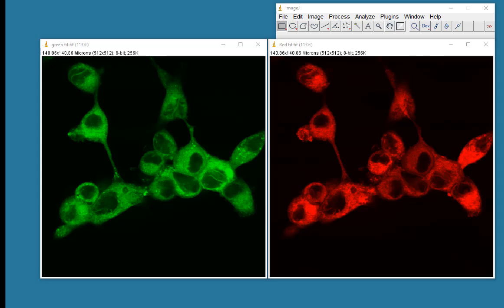In this video, I'd like to have a little look at co-localization. As you can see, I've got two images open.